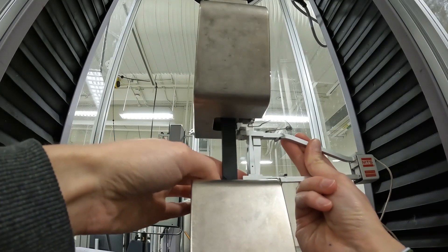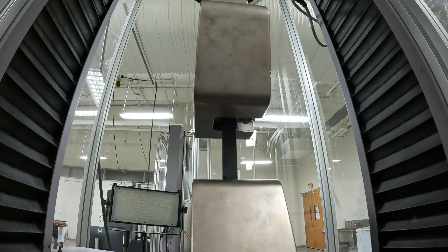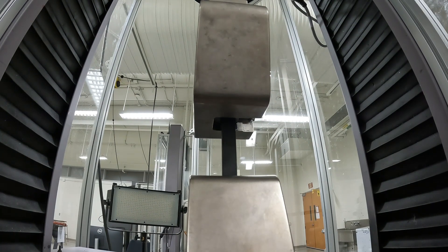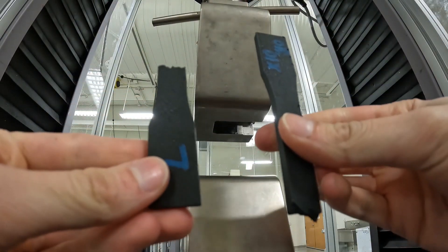After a sample is done testing, what I do is remove the extensometer, then loosen the chucks, and take the sample out.